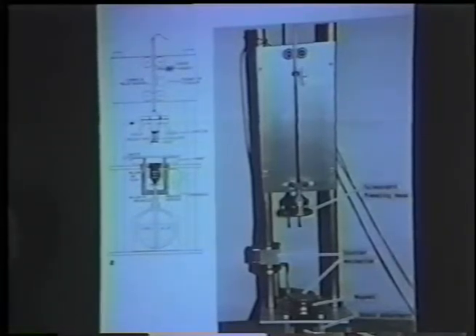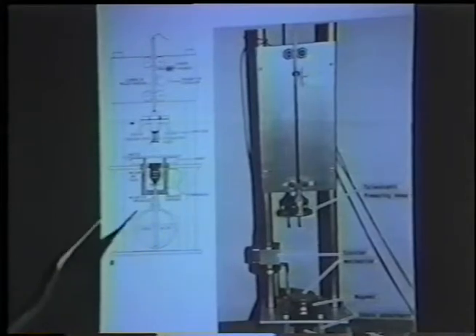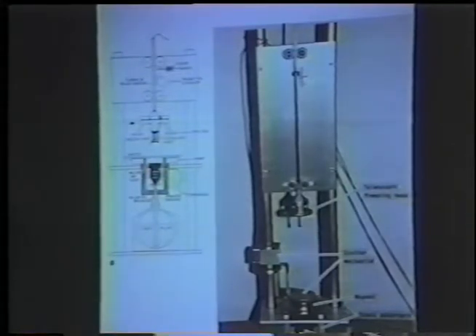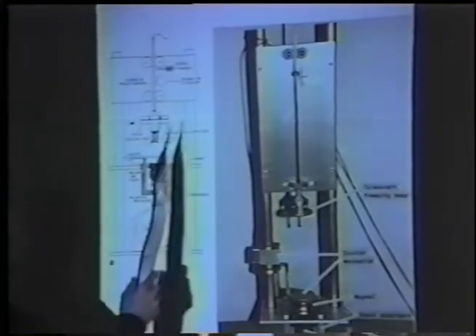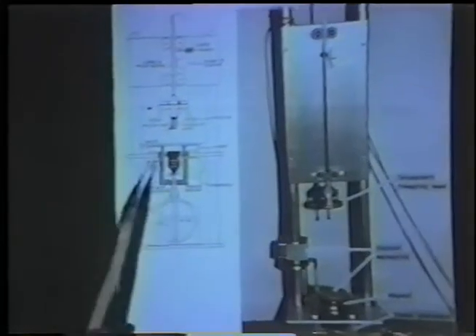Okay? One can also do other types of stimulation. One can rig up systems to spray some kind of an activator onto your cells as they're falling down if you want to stimulate some metabolic process. Or you could probably rig up something to actually inject a small quantity of liquid containing an activator or some other effector. Okay?